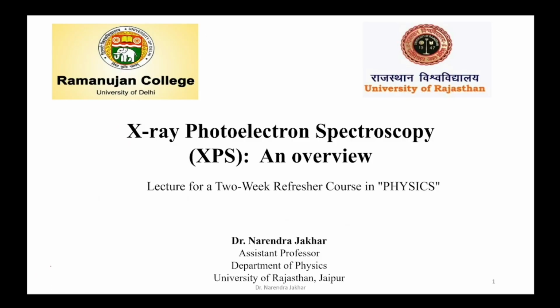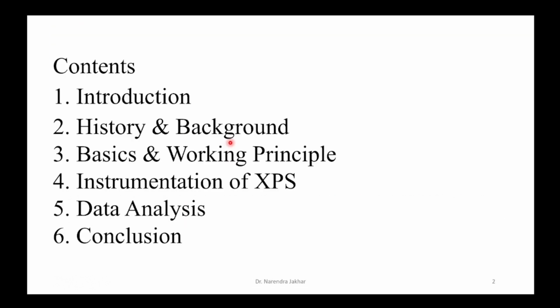We are starting with the discussion of XPS, an overview. These are the contents of my presentation. First, we will talk about the introduction: what XPS is, how XPS can be used to analyze the surface of any sample, and what information we can obtain from the sample, followed by the history and background.